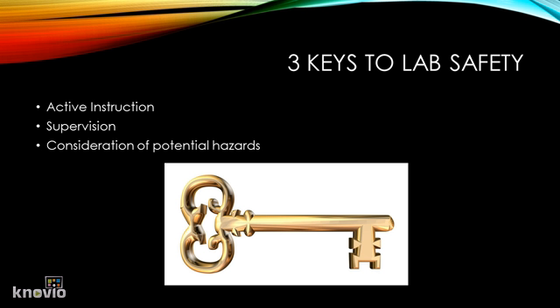Supervision is another key part that goes along with active instruction, so that during the lab, the teacher is moving from group to group, observing what the different lab groups are doing and making sure that they're doing safe things. They're using correct protocol, not doing anything dangerous.